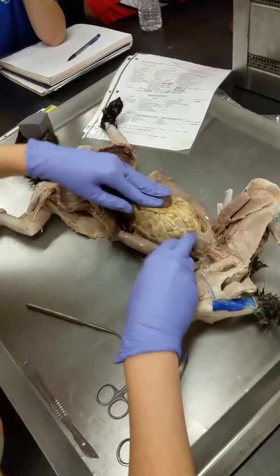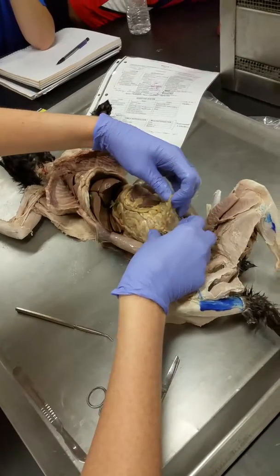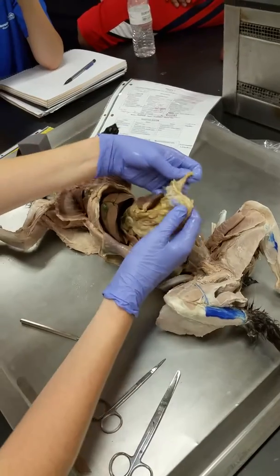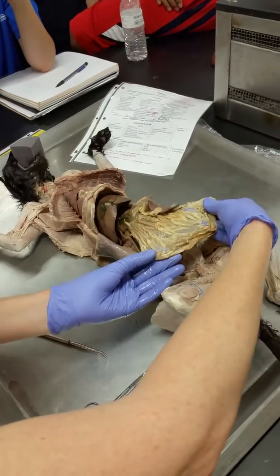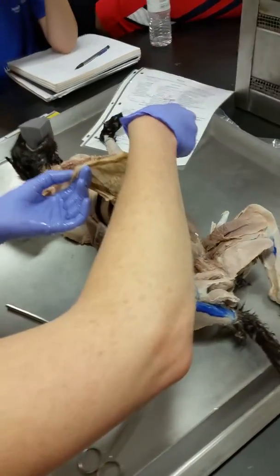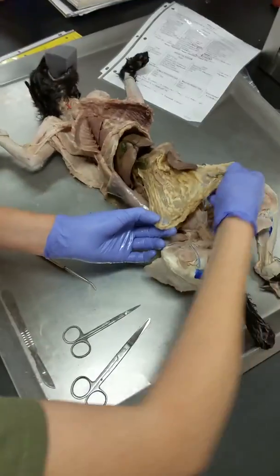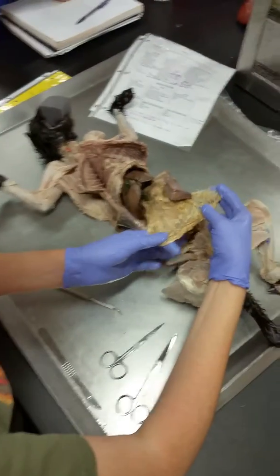Okay. Now, everybody see this? Ooh, this one's good. You guys all see this thing here? This is called the greater omentum. Oh, his guts are tiny. Okay. This is greater omentum. Greater omentum is made of dorsal mesentery.